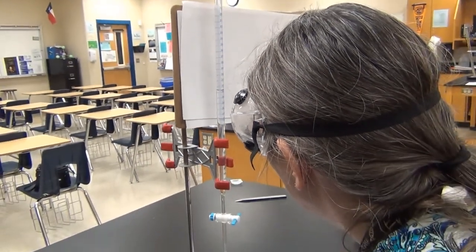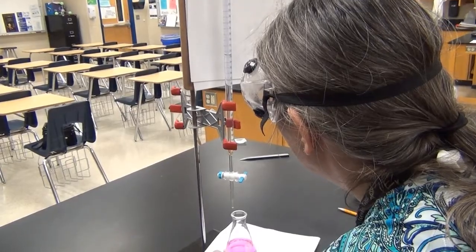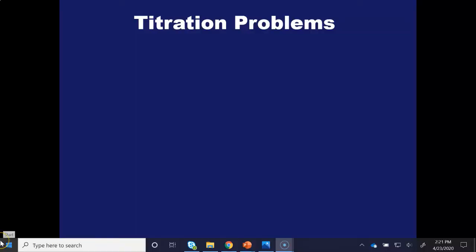So we've used this titration to standardize our sodium hydroxide, and now we have two trials where we have titrated an unknown acid with our known molarity titrant. And the nice thing about titrations is that subsequent trials tend to go faster than your initial, because the second time through I knew about how much volume of titrant I was going to need.